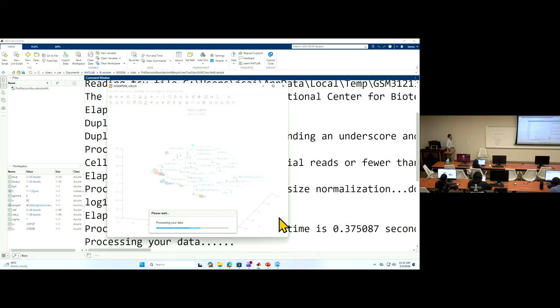I can see from the background that there are a lot of unknown cell types, because none of your marker genes support those small clusters as belonging to any given cell type you proposed. So this is an indication that your marker gene database may not be a good setup. So you really need to understand your sample better than this.